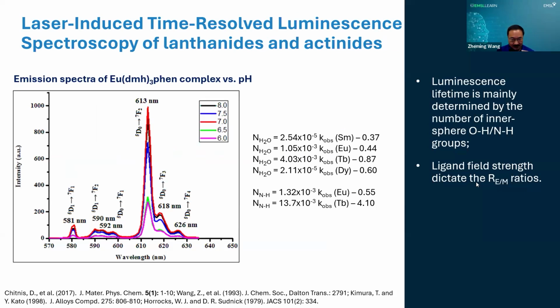Their spectra and lifetimes change a lot as their coordination environment changes. I show spectra changes here. And particularly, the luminescence lifetime shows a lot about their coordination and particularly hydration. Through these changes, we can specifically monitor how these chemical species change.